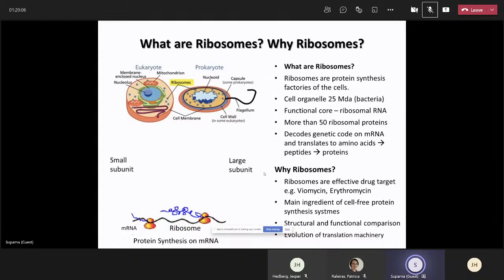And when we target ribosomes with some drug, since ribosomes are highly conserved in evolution, we would not like those drug molecules to target human cellular ribosomes. That's why it is important to study higher eukaryotic or human ribosomes in comparison with pathogenic bacterial ribosomes. Doing this in vivo or in situ in the cells is quite difficult. That's why we have engineered fully reconstituted translation systems, and the heart of those systems is the ribosome. So we need to purify ribosomes and to see how we can scale it up, so that drug screening, which is absolutely essential in today's antibiotic resistance era, will be feasible and useful.